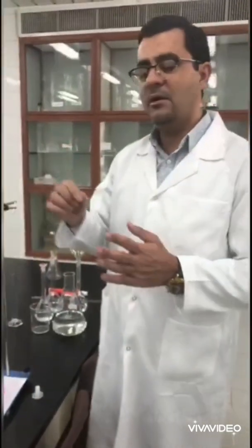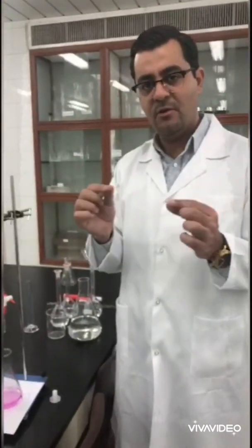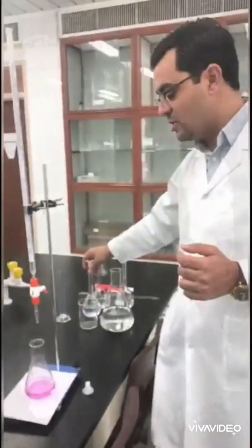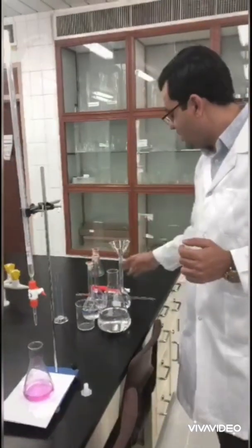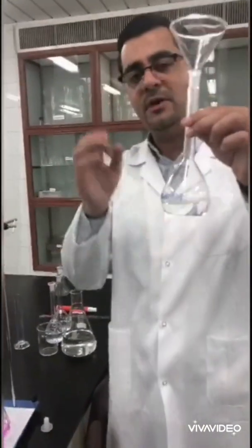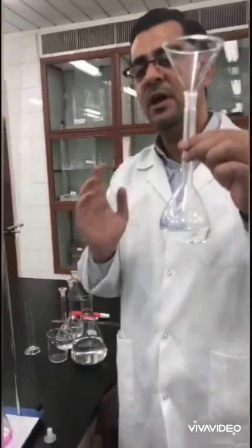As I will explain during the class, we will carry out a simple calculation process by which we can determine the exact concentration of sodium hydroxide solution. After this step, the concentration will be very accurate.